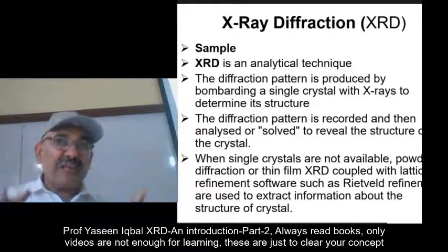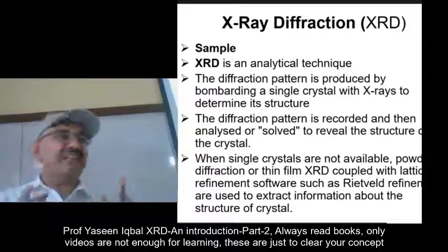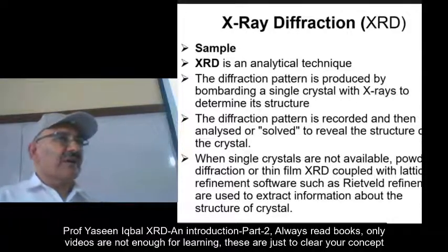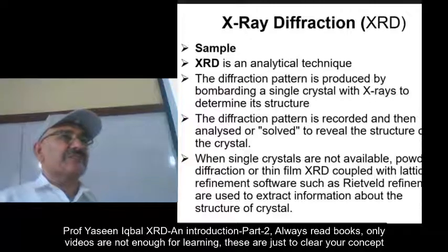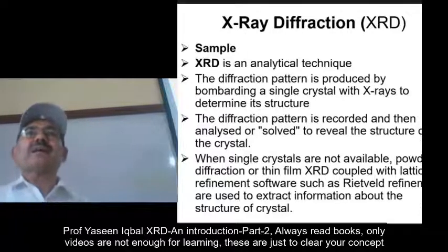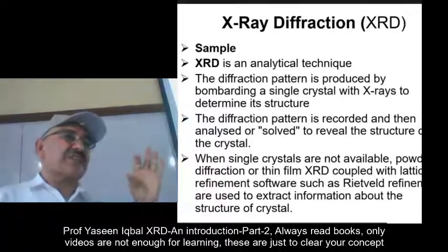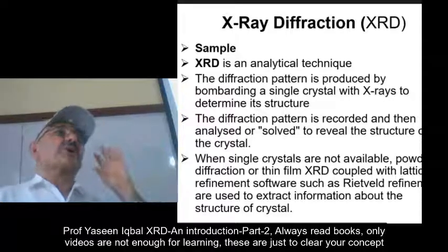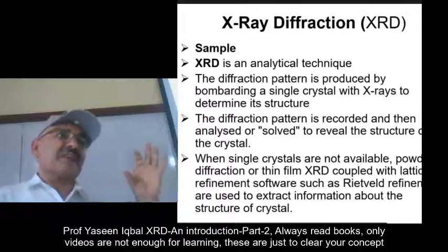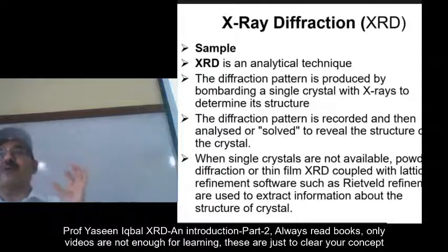When you match the X-ray data with a standard card, globally there are more than 100,000 crystallographic data cards published, used as reference materials. What do these cards have?